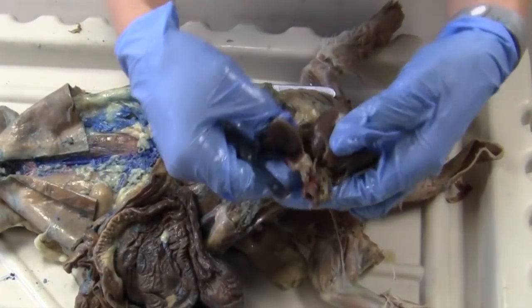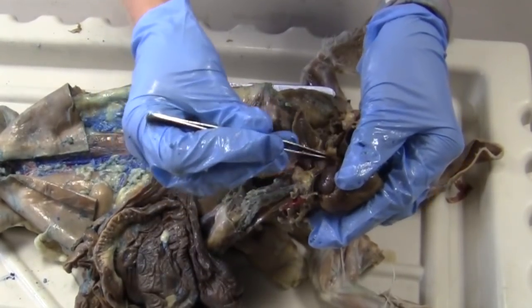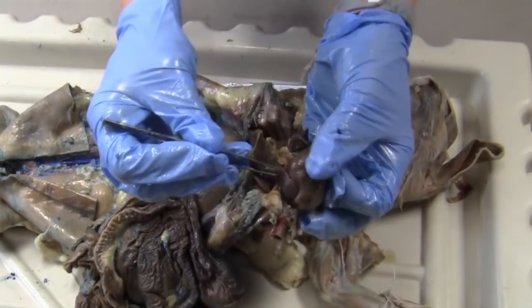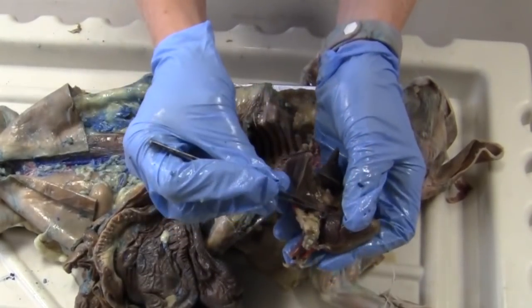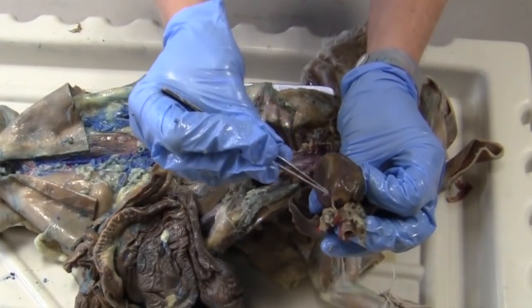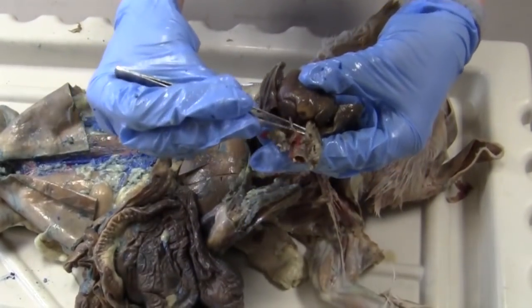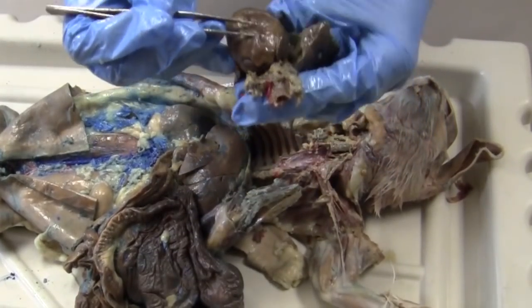Pulmonary veins are going to be coming out of, here's one right here, coming out of the lungs and back into the heart with oxygenated blood into the left atrium of the heart. So coming into the left atrium, into the left ventricle, then out through the aorta to the rest of the body. So be sure to find those as well. And like I said, you're going to have to clean up quite a bit of fat.